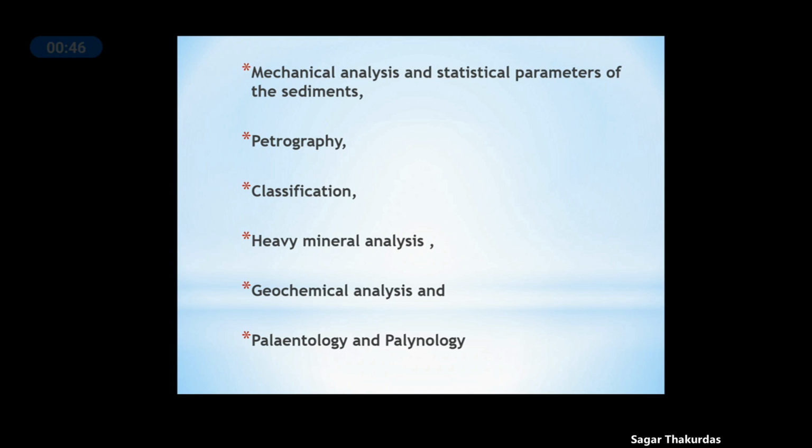The second thing is petrography. We can carry out petrological or optical studies of these samples in the laboratory by preparing thin sections, and also megascopic studies can be carried out to study the texture and structures of these sedimentary rocks.